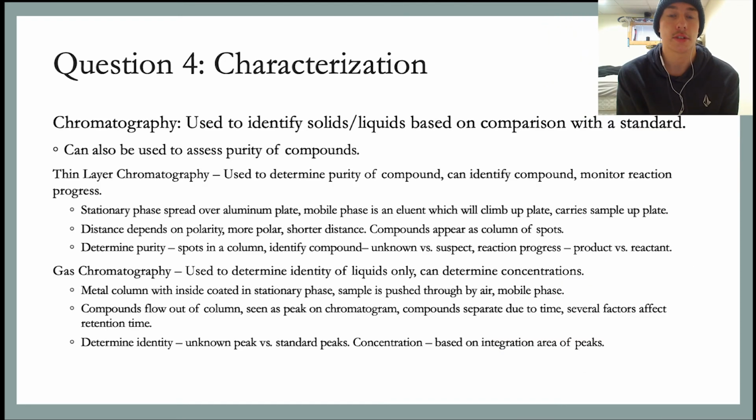That concludes the discussion on methods of purification focused on throughout this course. So next we move on to methods of characterization discussed throughout this course, beginning with chromatography, which can be used to assess purity and identify solids and liquids based on comparison to another solid or liquid.